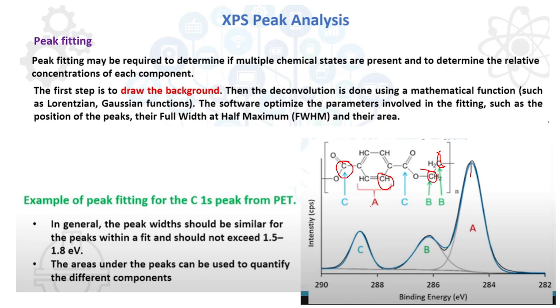And C, that is bonded with the oxygen, is coming around 289. And this B, since it is also bonded with this oxygen, is coming around 286. Now why is this? Because whenever there is an electronegative atom, it is trying to attract the electron of this carbon atom, from the valence shell. So whenever it is attracting, the effective nuclear charge on the 1s will be higher.